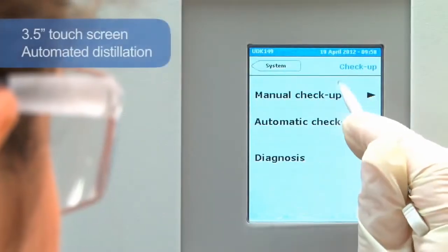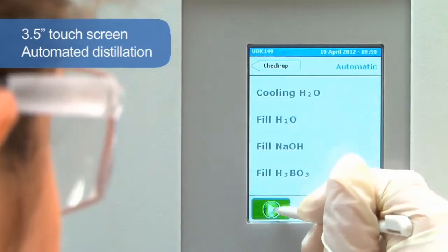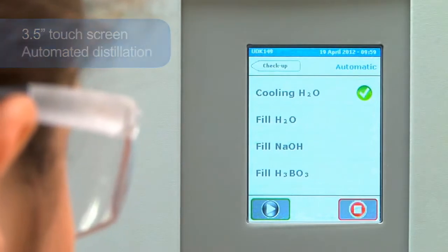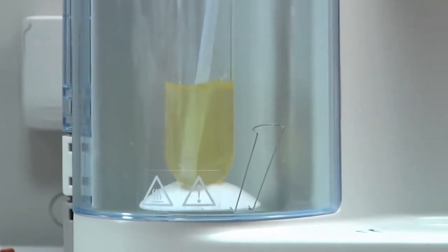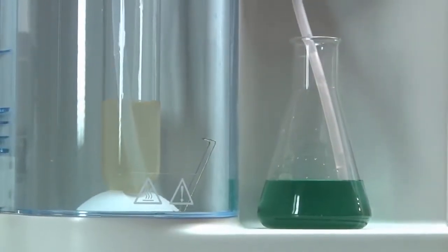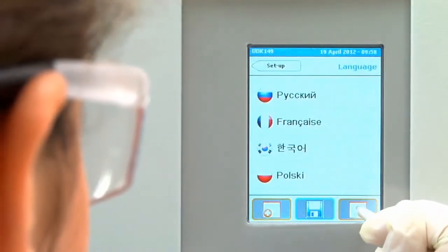With a 3.5-inch touchscreen color display, the UDK 149 achieves automatic distillation through alkali, dilution water and receiver solution addition, with pre-programmed distillation protocols and reaction times. It provides regulated steam output and conveniently automatic draining of sample residues. The most commonly used languages are pre-installed.